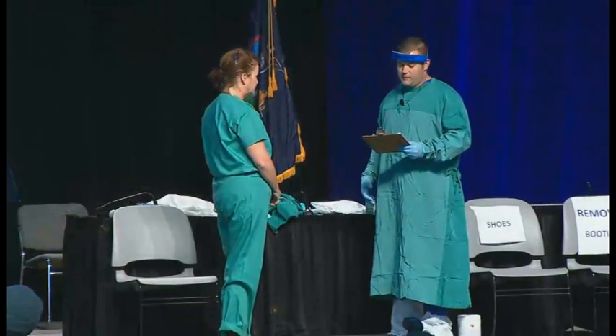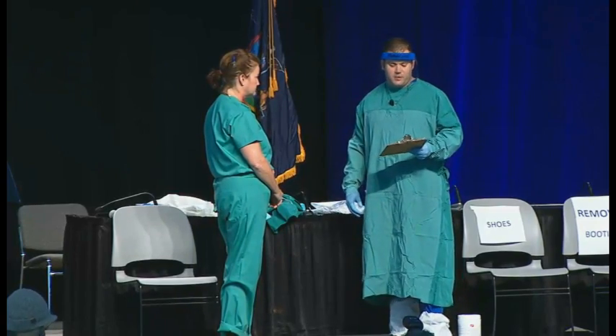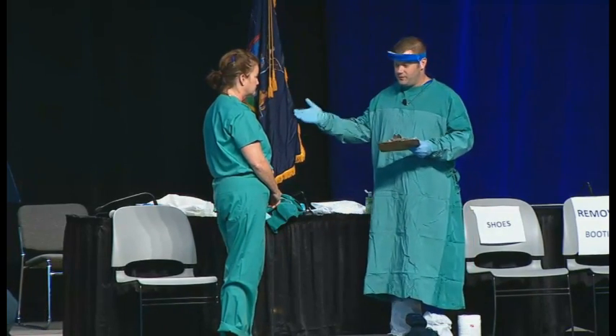Next, Barbara's going to make sure that someone is supervising her, or even acting as a buddy. The person in my role should be trained on all aspects of PPE and infection control. Her trainer is going to make sure that she is wearing scrubs and washable footwear, and that she's removed all personal items, such as jewelry, phones, pens, and pagers.